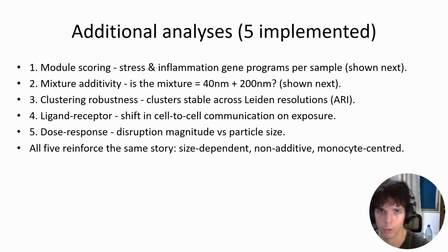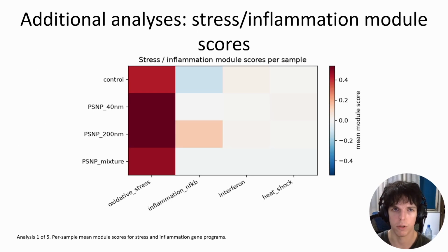For the additional insights part, I implemented 5 extra analyses, which this slide lists, and the next slide shows each one. They are module scoring, a mixture additivity check, a clustering robustness check, a ligand receptor communication analysis, and dose response.